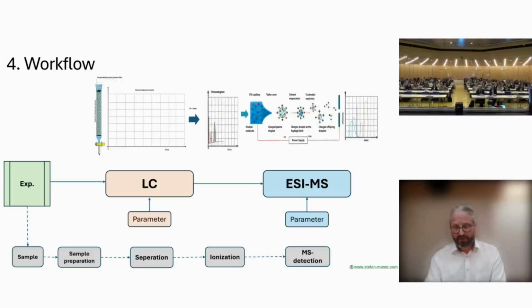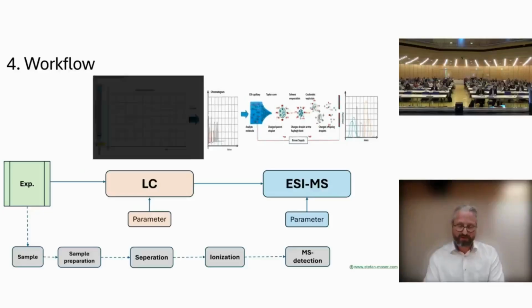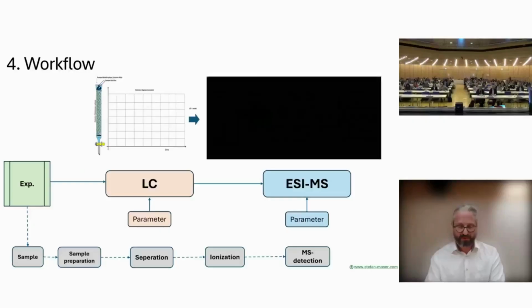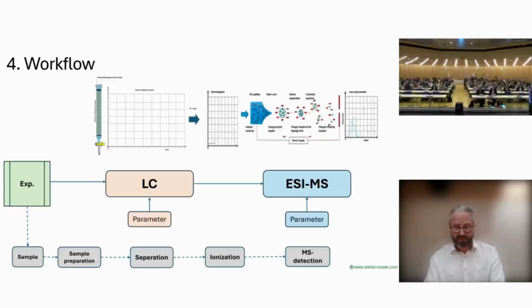Plants are incubated under controlled conditions, then harvested and stored frozen to ensure reproducibility before further processing. Each sample then passes through a fully automated analytical chain like HPLC, ESI, TOF, and MS. The modular setup allows us already at the planning stage to define which parameters can later be statistically evaluated. It helps us clearly see the effects and understand them better.